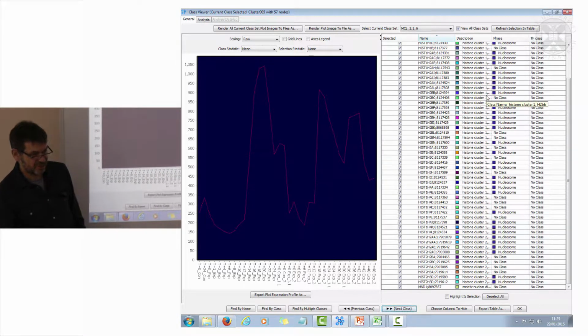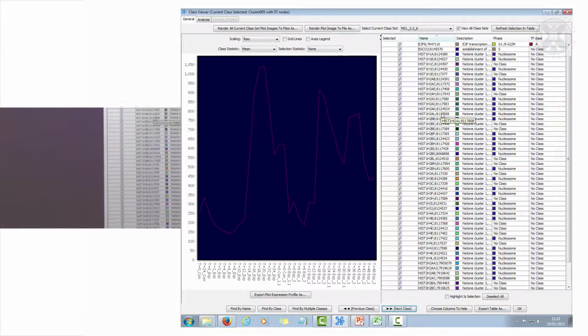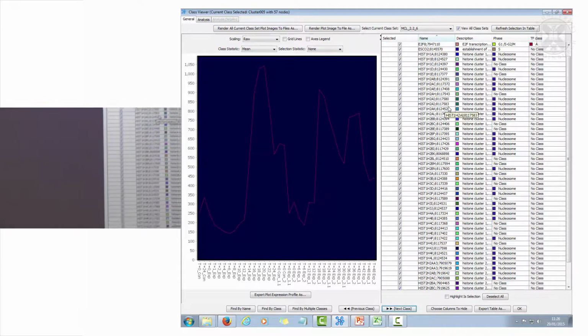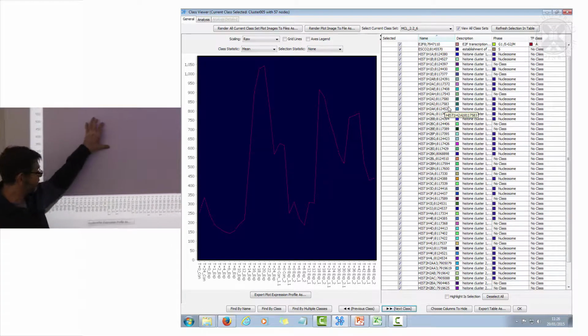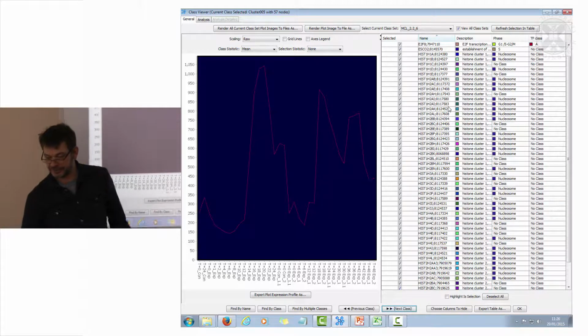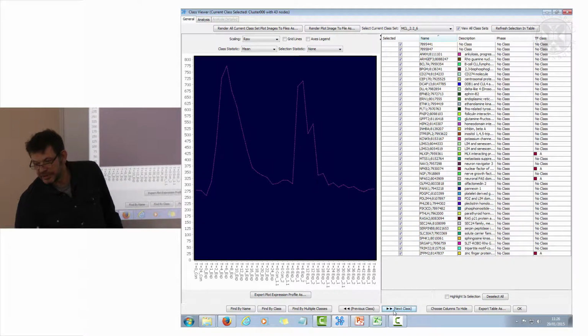Beautiful enrichment of histones there. You don't need a GO ontology to tell you what this list is and why they might be related. Okay, all the histone genes are going crazy. They're all captured. They have this quite specific pattern, which is different from a lot of the other cell cycle genes. Okay, and again, we'll just wander through here.